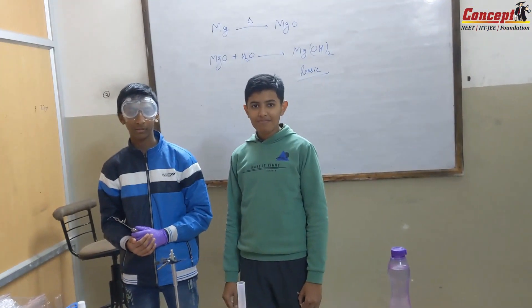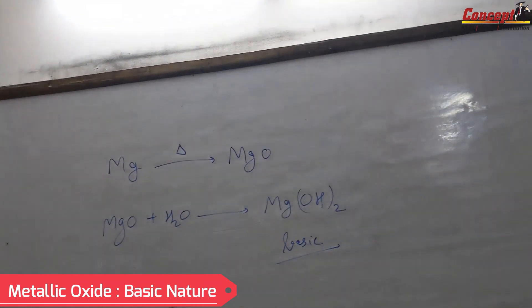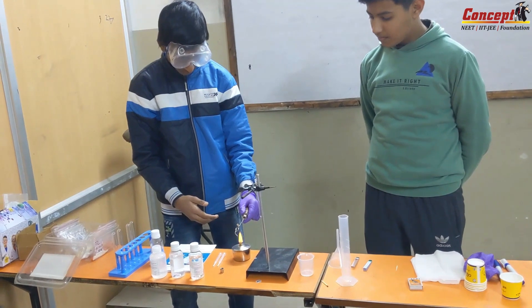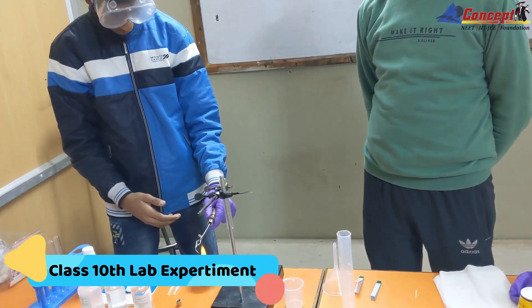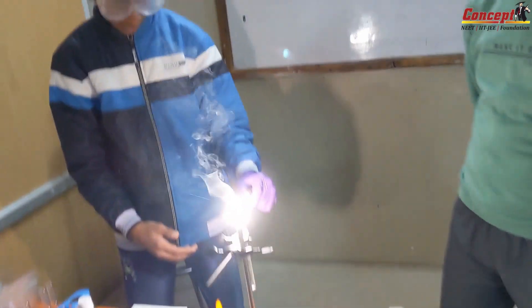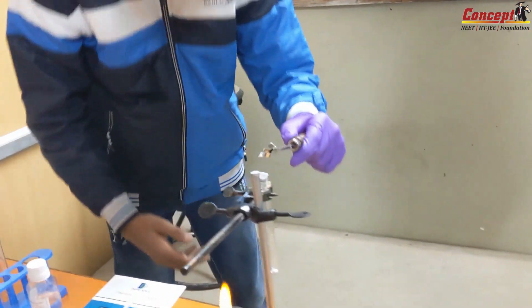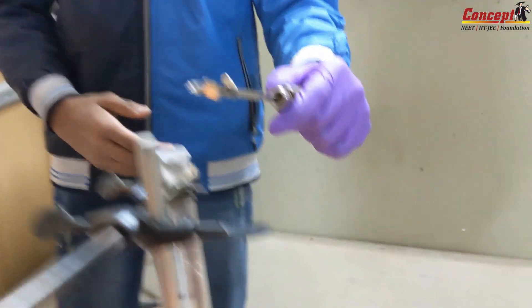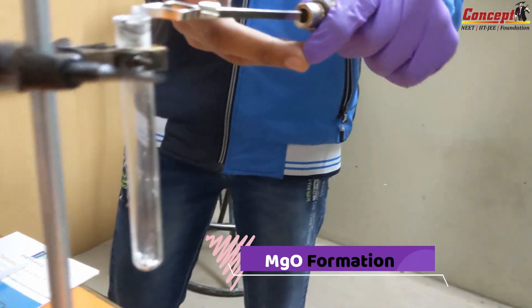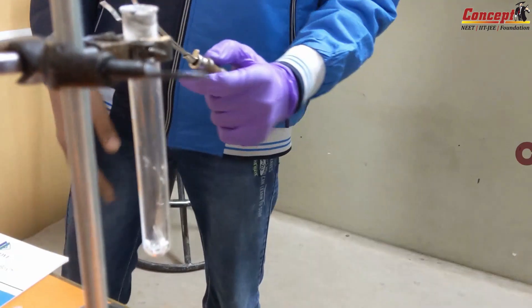So now these students are performing the oxidation of magnesium through this reaction, as you can see. So this is magnesium oxide. Can you see the white powder? This is the oxidation of magnesium.